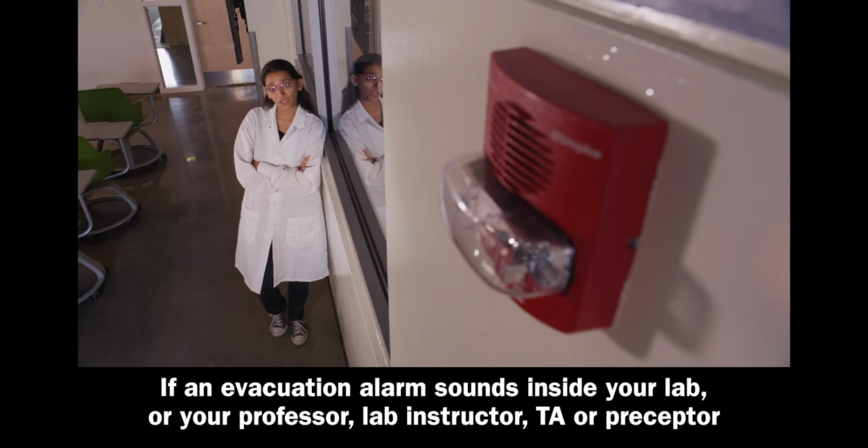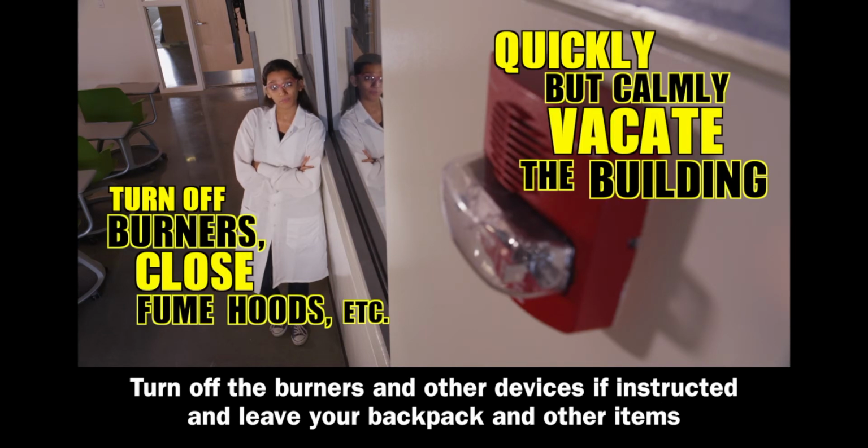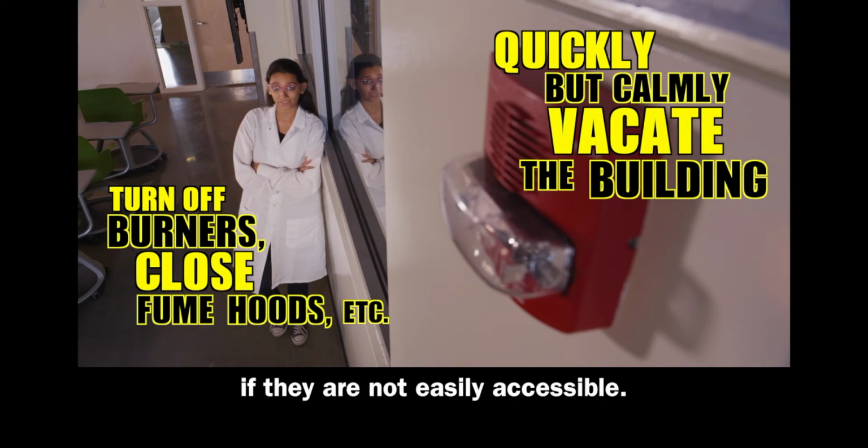If an evacuation alarm sounds inside your lab, or your professor, lab instructor, TA or preceptor orders an evacuation, quickly but calmly vacate the building. Turn off the burners and other devices if instructed and leave your backpack and other items if they are not easily accessible.